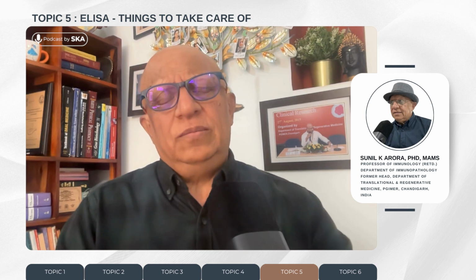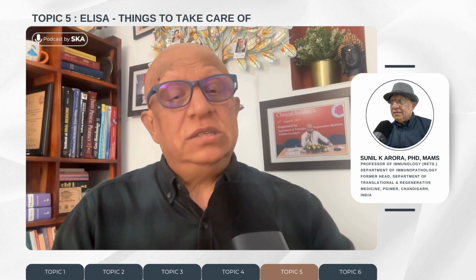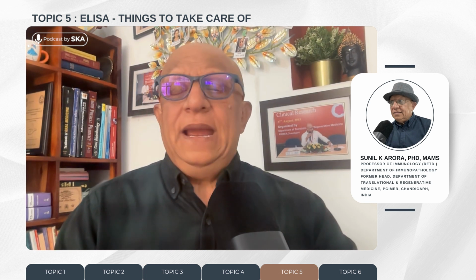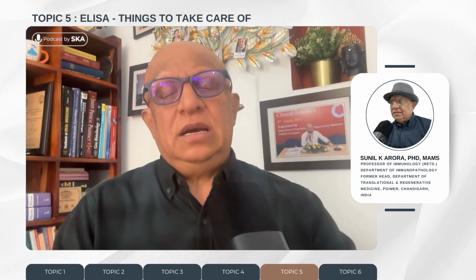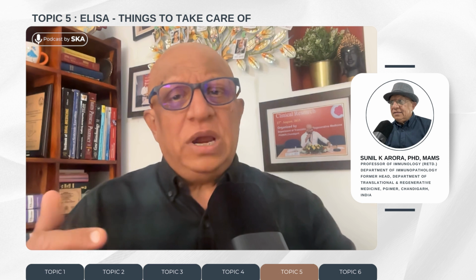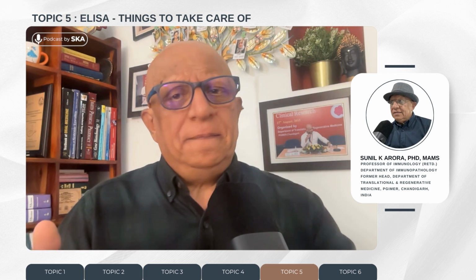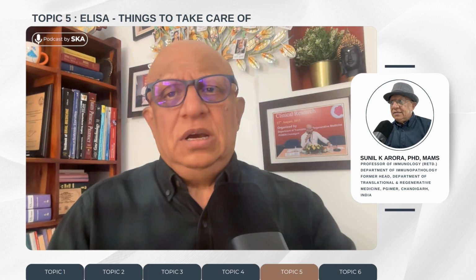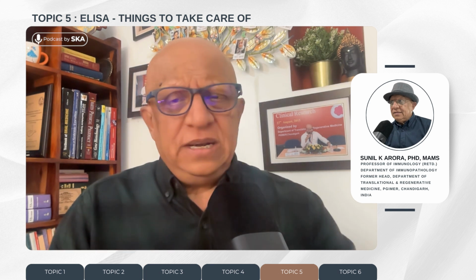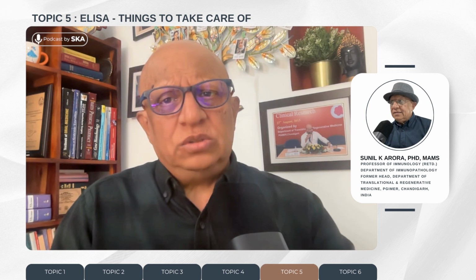So very very good techniques. These are the ones which are nowadays done in almost every immunology laboratory, and the only thing is that the person has to learn the way you have to do the washings, and incubations have to be done at the proper temperature. Normally all the antibody incubations are done at 37 degrees centigrade. The coating step can be done overnight at 4 degrees centigrade also.